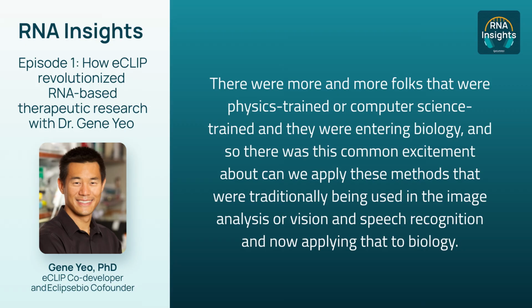always some loss. We couldn't do as many replicates as we wanted from the sequencing costs that we had for early instrumentation. We could have definitely optimized some of these digestions for individual RBPs. But overall, I'm pretty happy now with the initial draft of these data sets. They've all been leveraged by hundreds of labs and many companies, including biotech companies as well.